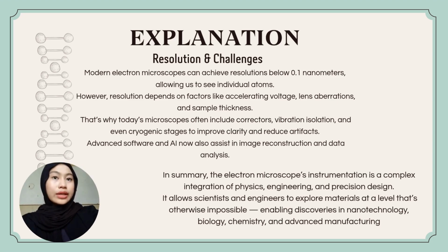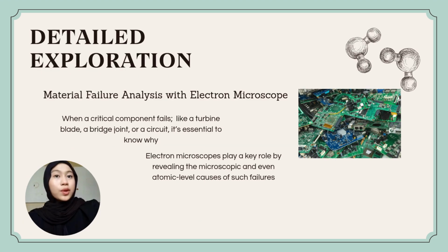In summary, electron microscope instrumentation is a complex integration of physics, engineering, and precision design. It allows scientists and engineers to explore materials at a level that's otherwise impossible, enabling discoveries in nanotechnology, biology, chemistry, and advanced manufacturing. Let's now explore a crucial real-world application, which is material failure analysis.